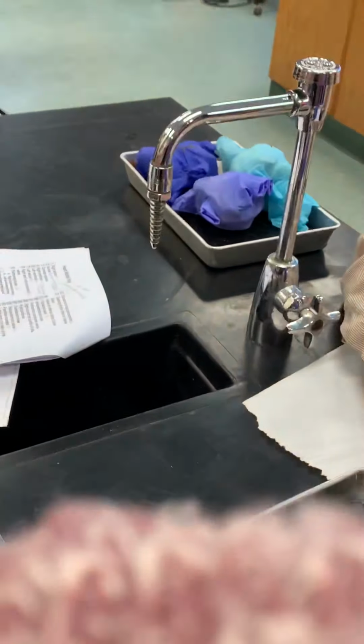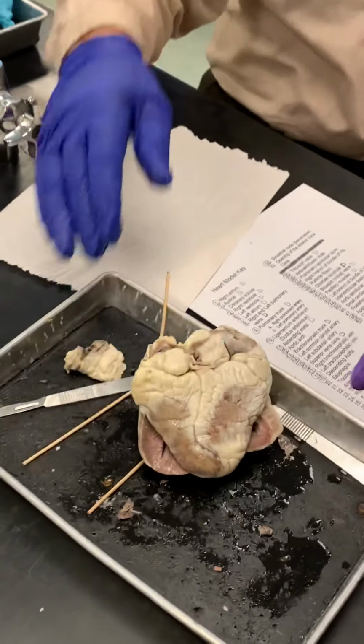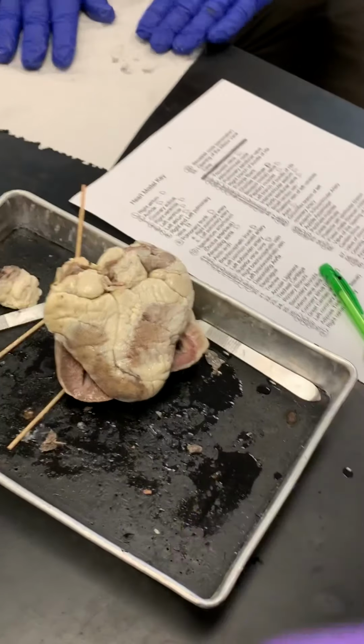But on the sheep's heart, a lot of times it's pretty close. So if you'd still see it, it would be right here. So if there's another one where you see it, I'll point it out to you when I see it on one of the other ones. Okay. Oh, we have to do more? No, you got to keep going.